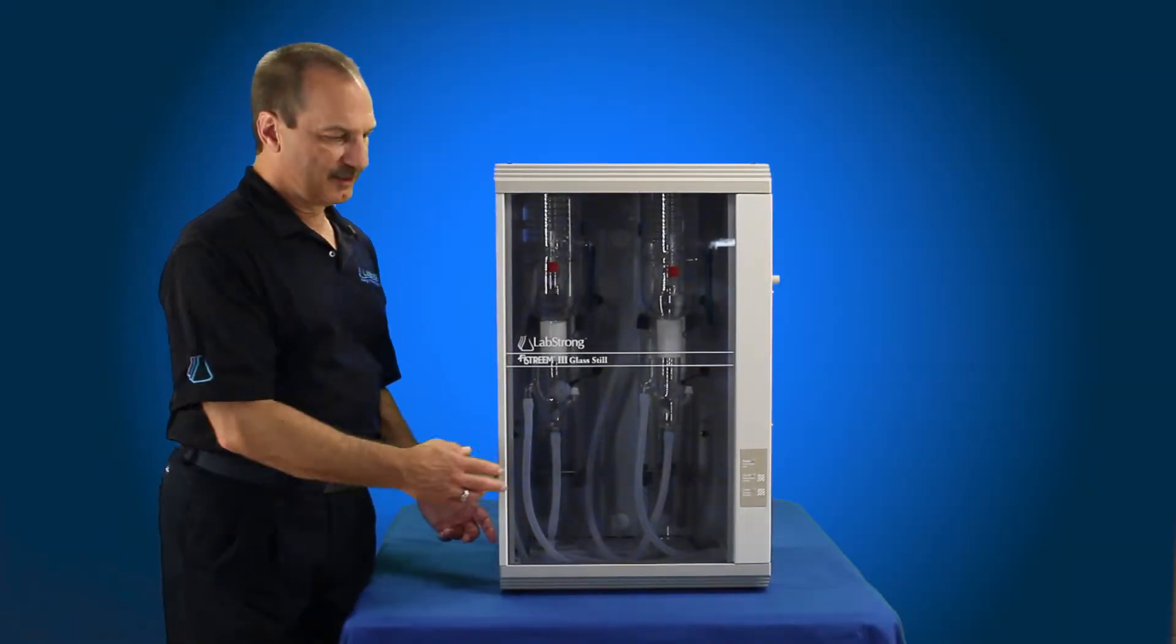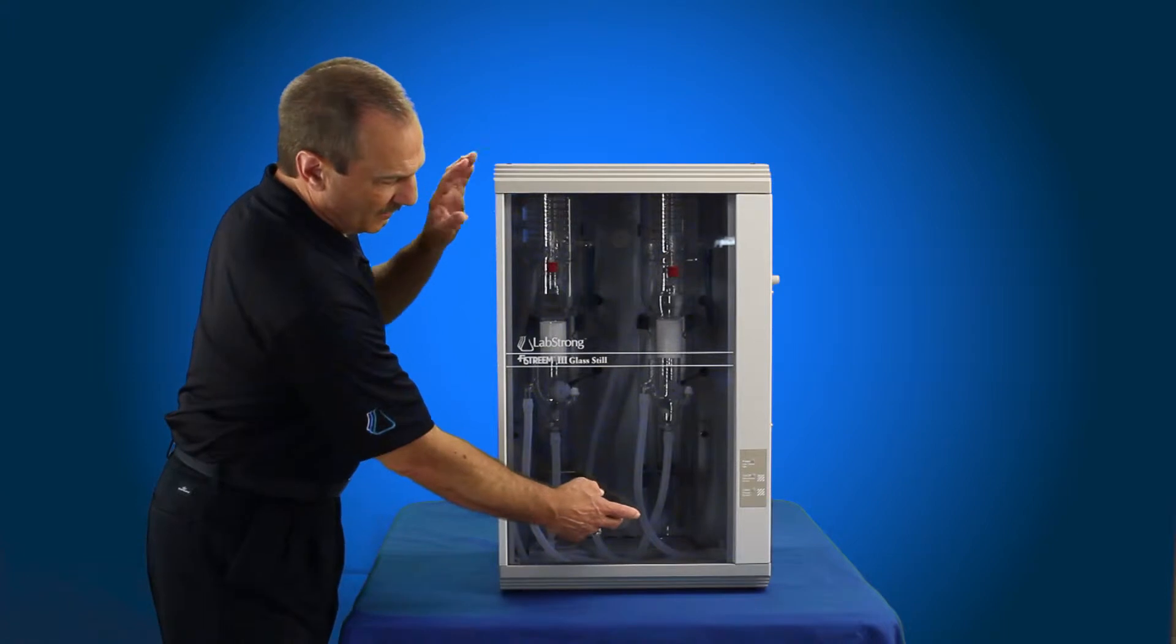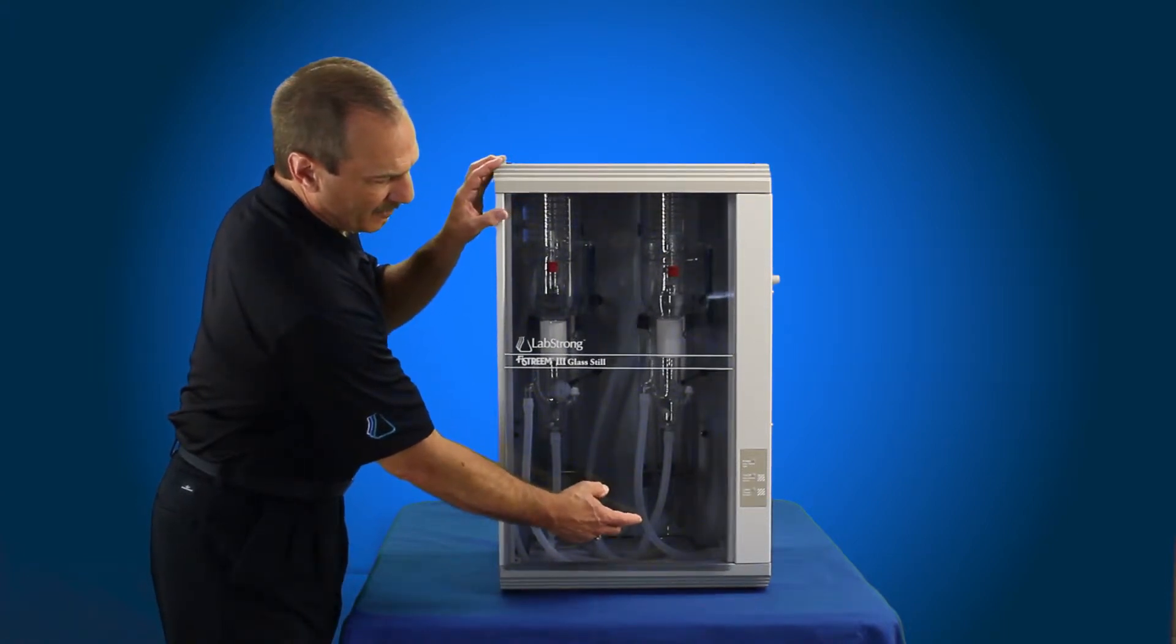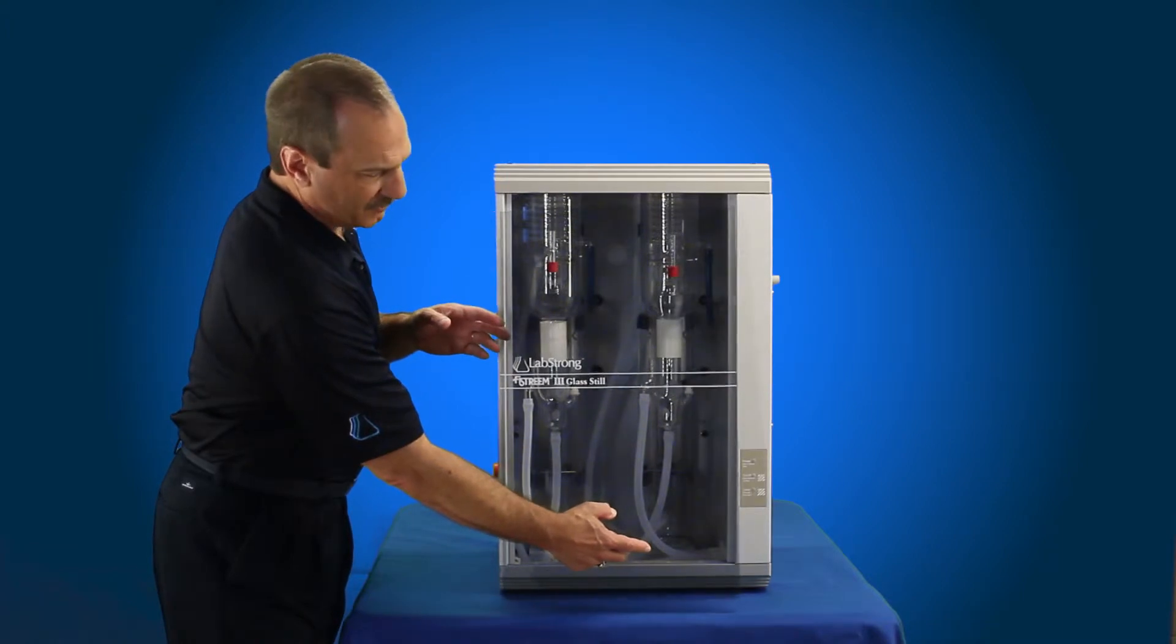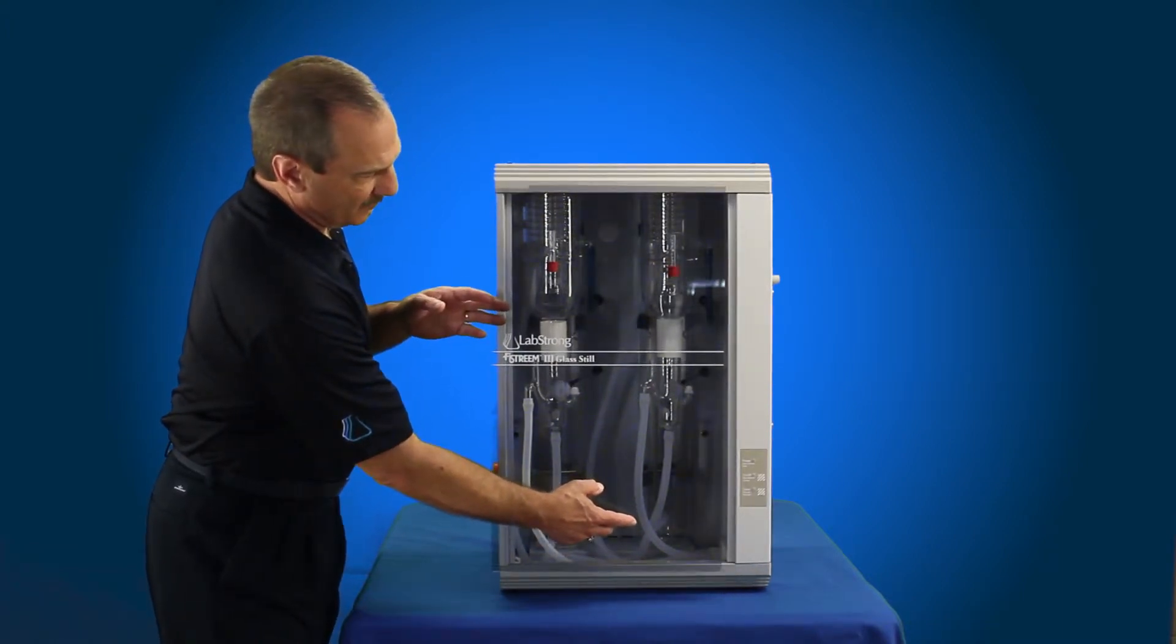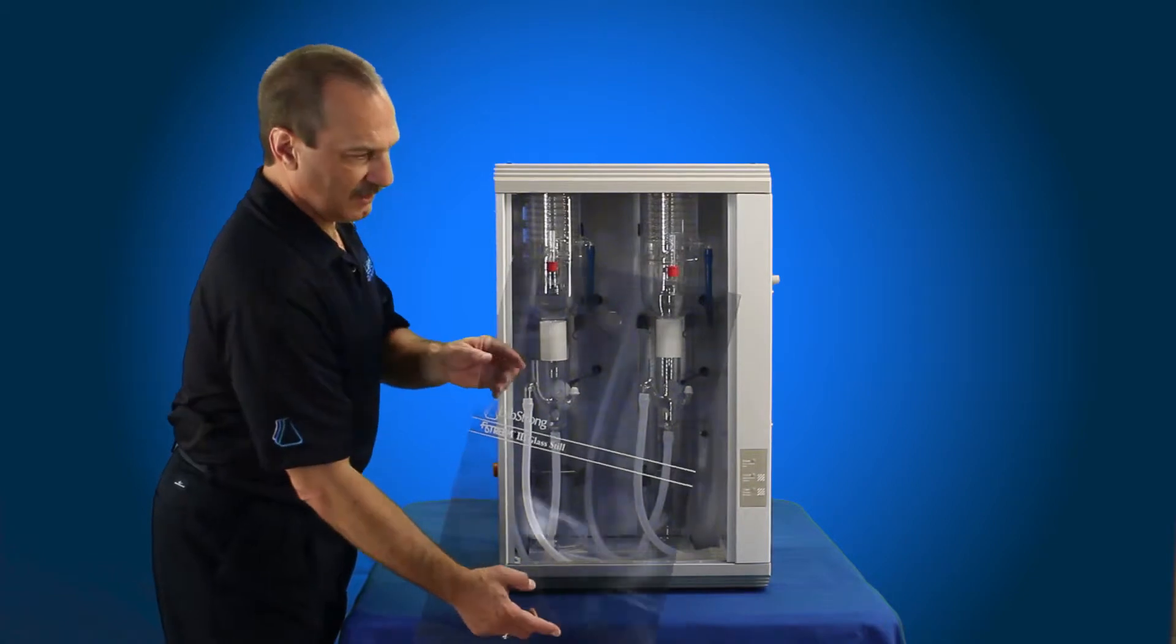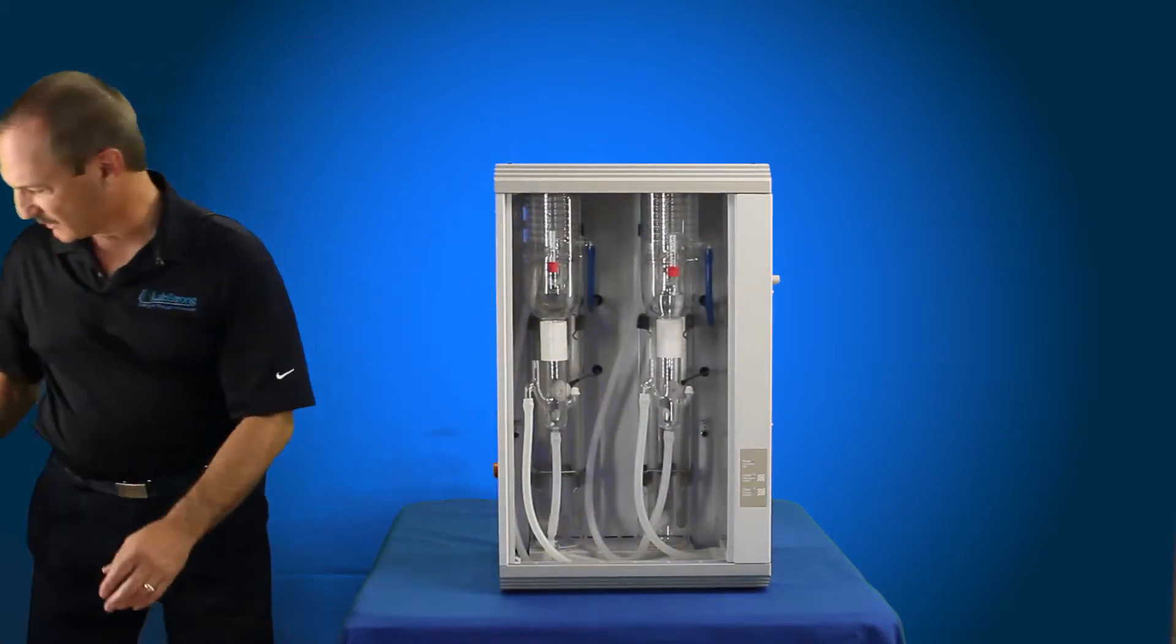Now we're going to remove the door from the eight-liter per hour FiveStream 3 system. The FiveStream 3 four-liter per hour system, single distilled, has the same type of door, it's just a little smaller. So you're just basically going to lift up, pull out of the bottom, pull the top down, and you remove the door. Set that aside.